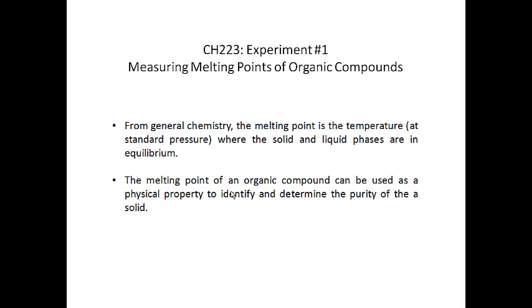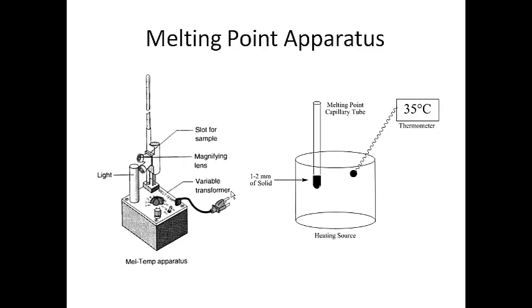If you had a white solid of, let's say, some illegal drug that melted at 50 degrees and your sample melted at 100, then you could clearly say that's not that sample. So first we'll learn how to take melting points of organic molecules, and every time you make a solid in the lab course, you're going to measure its melting point and compare it to the literature value that you can find in places like the Sigma Aldrich website, the CRC handbook, or any list of literature values.